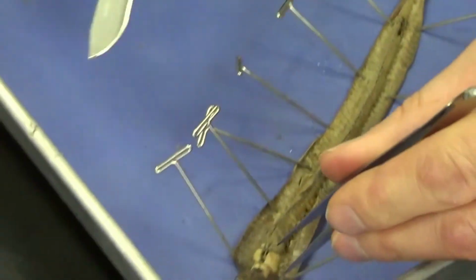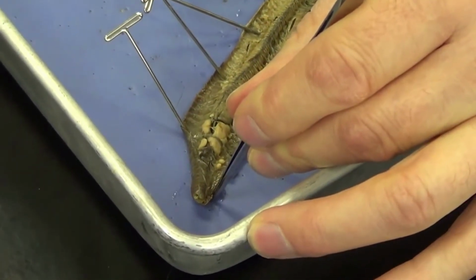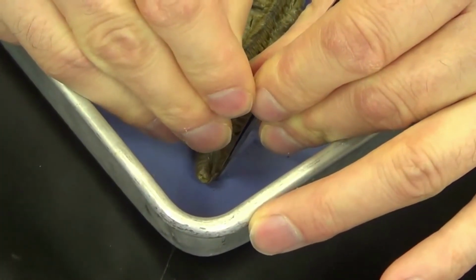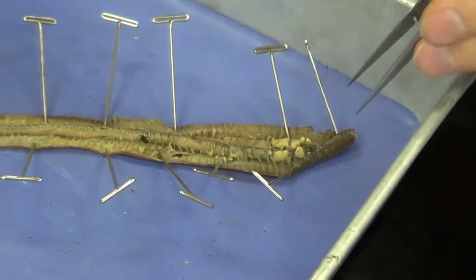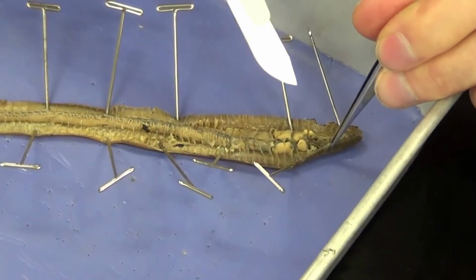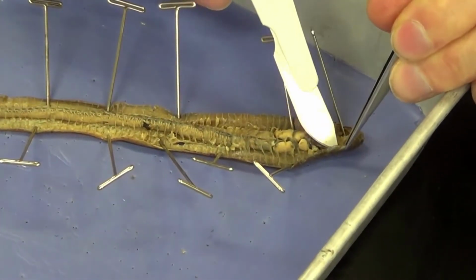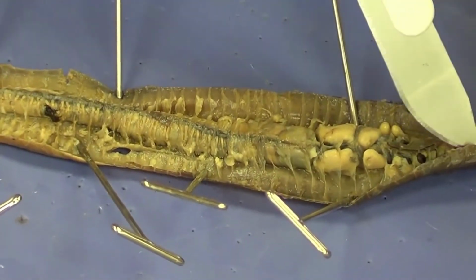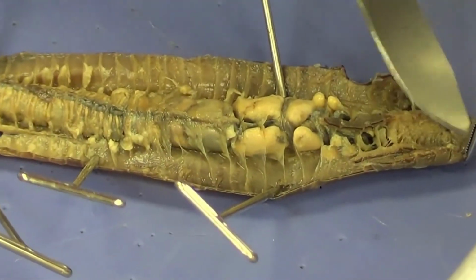And we're almost to the mouth. Cut through some remaining septa there. And then one more cut should do it. So the skin's going to be adhering very tight here, so I've got to be careful. The brain's up here too, and if we're lucky, we'll get to see the brain.